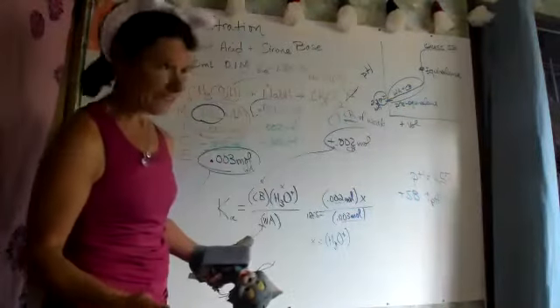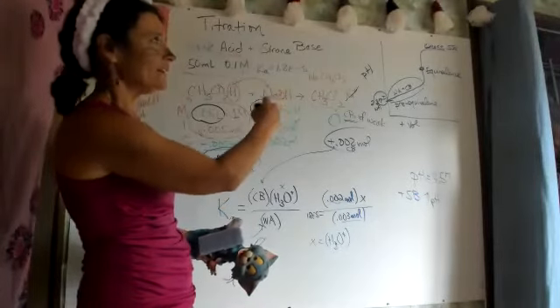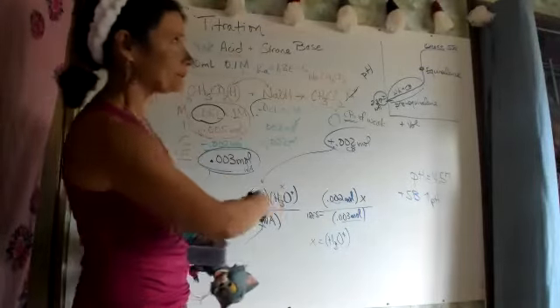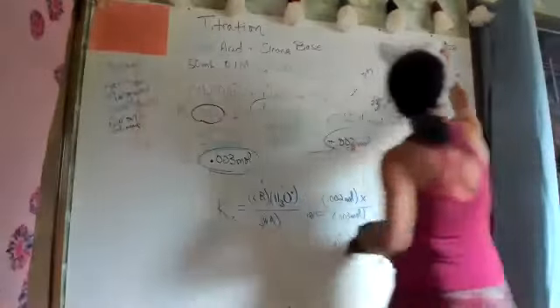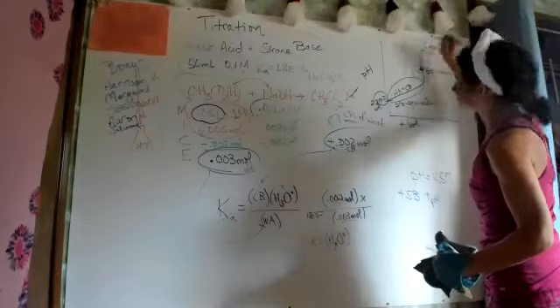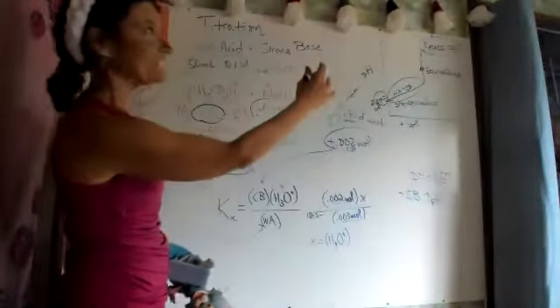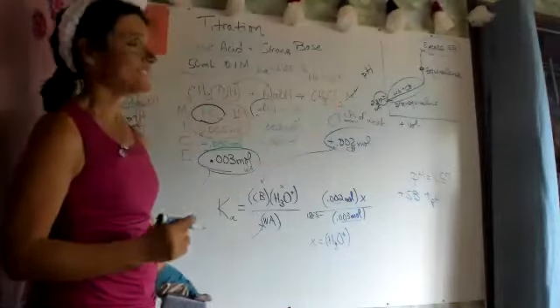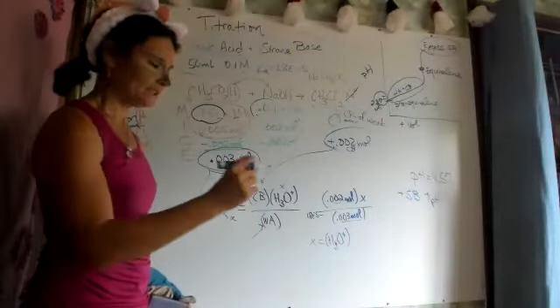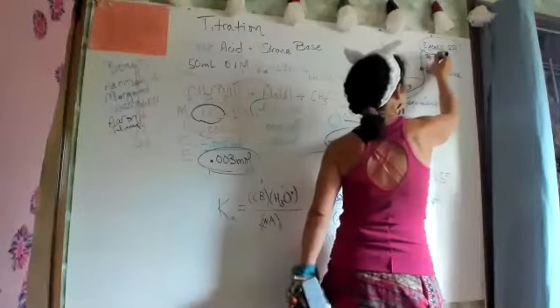So the only point that really matters in the titration is that equivalence point. Right now we're pre-equivalence, and here you can either say I'm at the excess point, or you can say I'm post-equivalence.